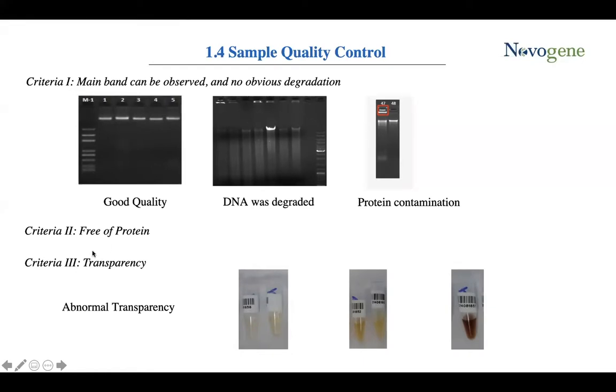Criterion number 2 is that the DNA should be free of protein contamination. We can look at the picture on the right, where we can see bands in the loading well, which is basically protein contamination.